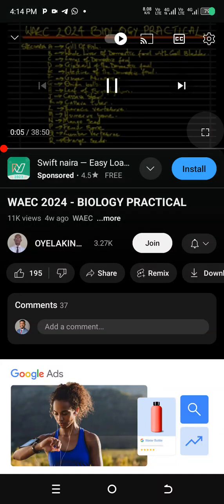Quickly, we want to look at the WAEC 2024 biology practical specimens, the specimens that have been released by WAEC for this year's practical exam in biology. Those are the things we want to look at right now, and we'll be picking it up from specimen A. Here we have listed all of the specimens that will be used.